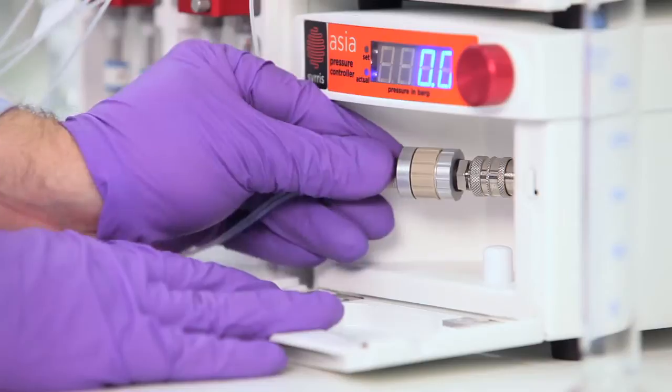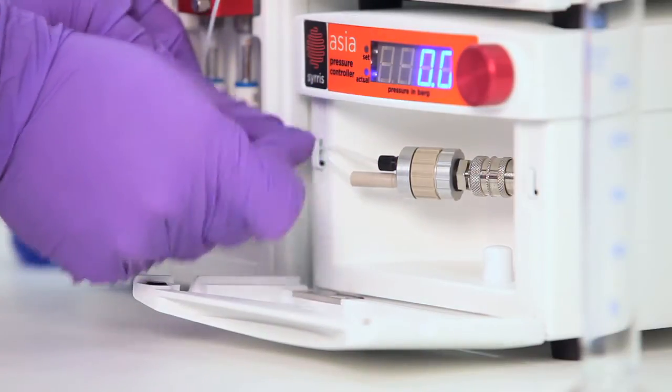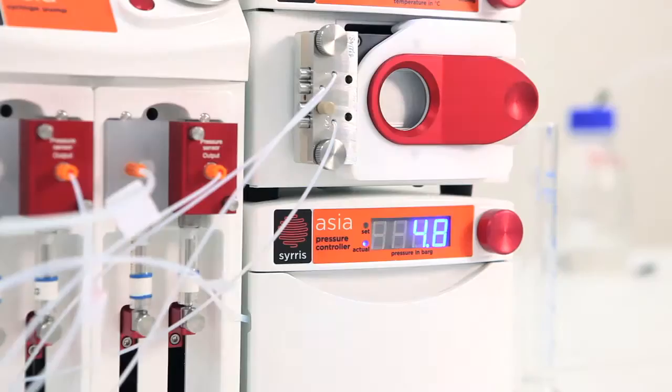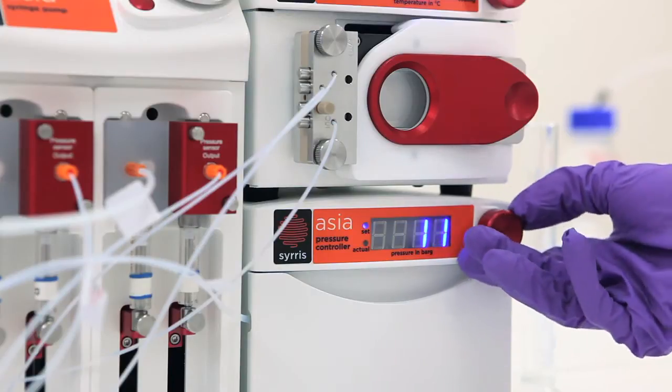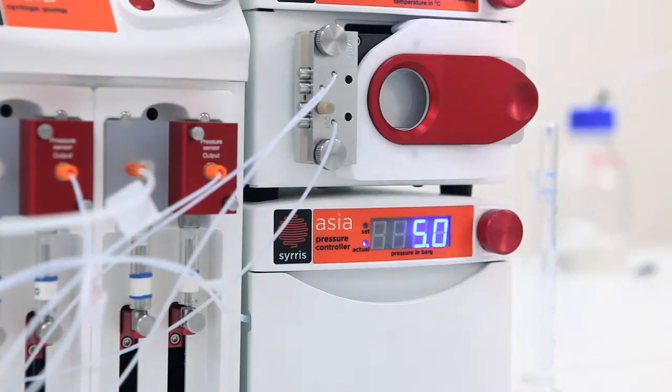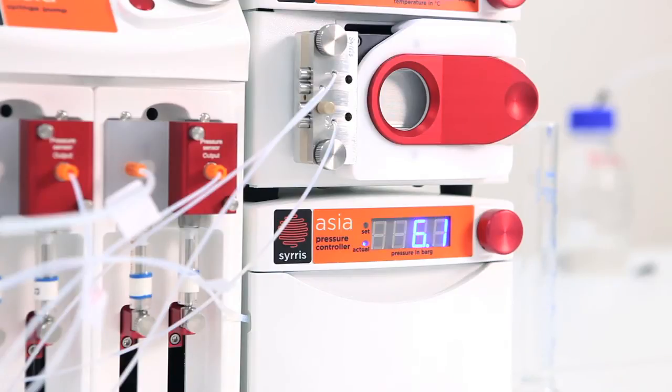Asia can deliver a thousand-fold increase in reaction rate by heating solvents above the boiling points. By pressurizing using the pressure control module, the boiling point is increased.